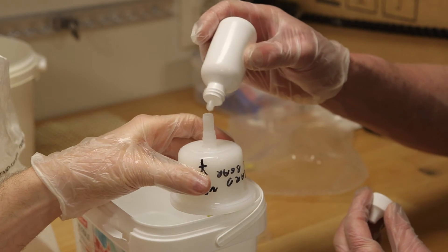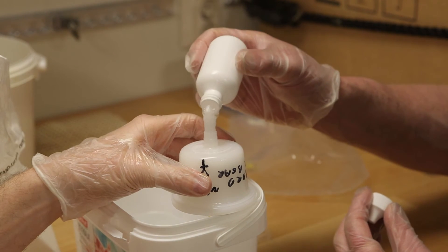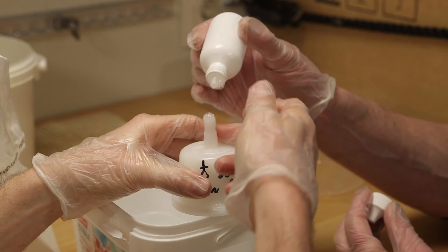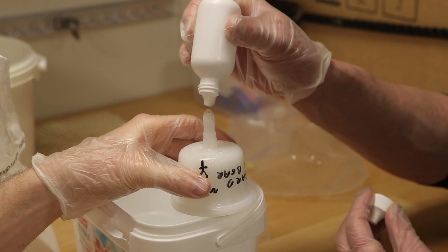Now we are adding the buffer to preserve the DNA in this filter. We will close it and store it in the fridge until we can dispatch it to the laboratory for the DNA analysis.